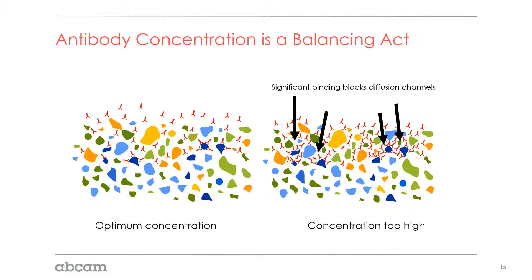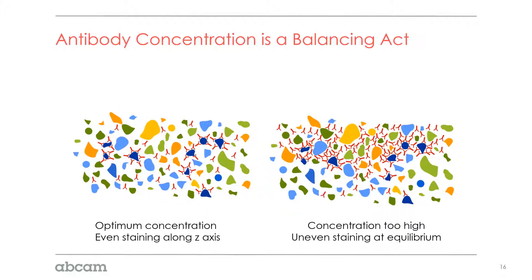At the optimal concentration, you get good penetration through your tissue. But at a concentration that's too high, the antibody blocks the channels through the tissue and cannot penetrate further in. You'll get a very dense ring of staining on the outside — a telltale sign that concentration is too high. With uniform labeling, all epitopes are labeled evenly through the depth, whereas at too high a concentration, you get uneven staining and a dense band outside the tissue, which is non-ideal.